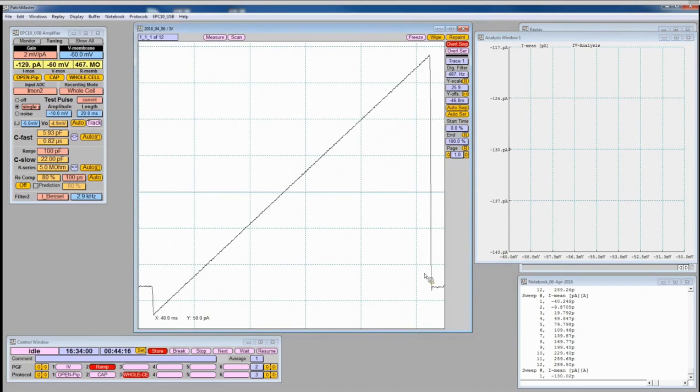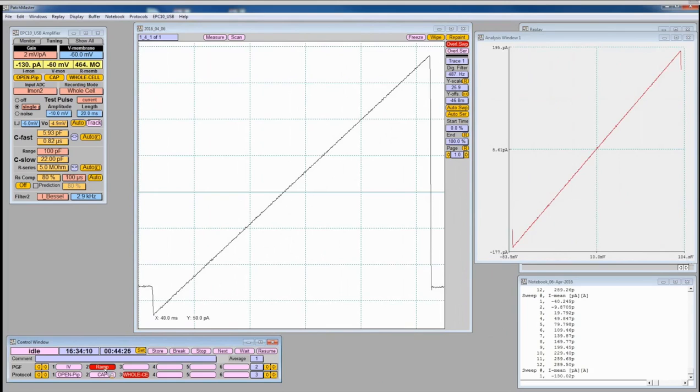Okay. And now I can either record again or not record. It doesn't matter. The analysis will be done. Let's not record it for now. And press ramp. Done. Okay. So here you see basically the IV plot of this response. Now, there's one thing before we finish here.